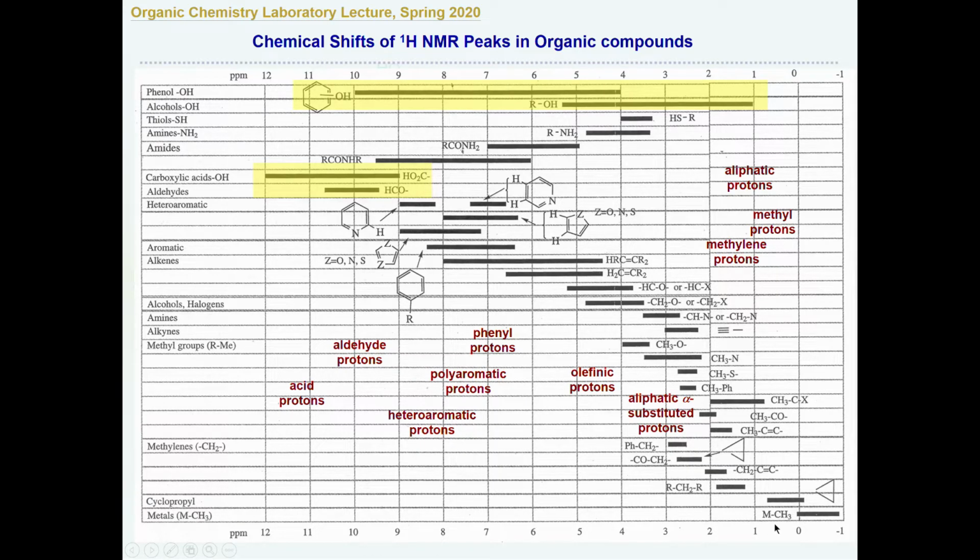So without knowing exactly the reason, you can see most aliphatic protons are going to be located around 0.5 to 1.5 ppm, in this aliphatic region, because it's a simple carbon and hydrogen linked together. There's no electronegativity difference. So the chemical shift will be here as a base.